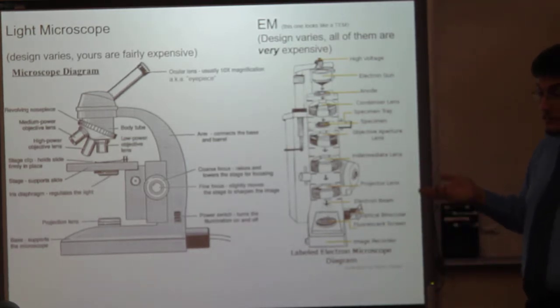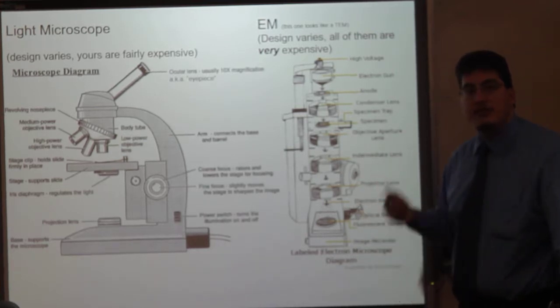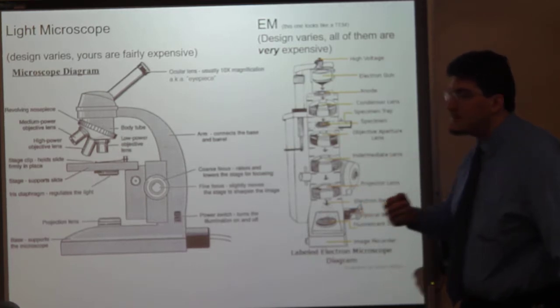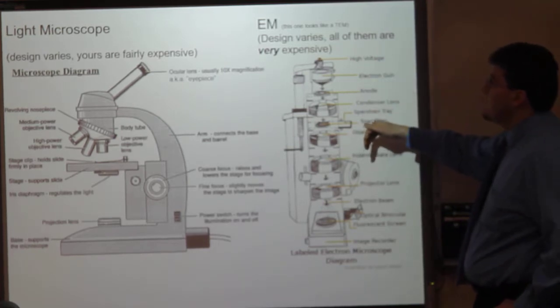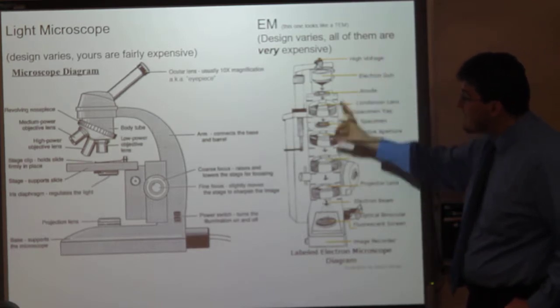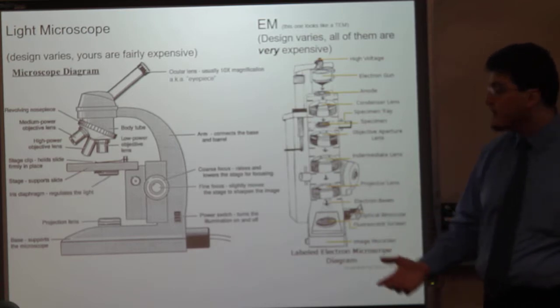And possibly also push it through a vacuum chamber and evaporate all of the water inside of it. So, electron microscopes are not conducive to water-bound, water-filled specimens, or even specimens contained in water. Now, the electron beam will go through the specimen in a transmission electron microscope. In a scanning electron microscope, the electron beam will bounce off of the surface of the specimen and then go through a series of aperture lenses and intermediate lenses, etc.